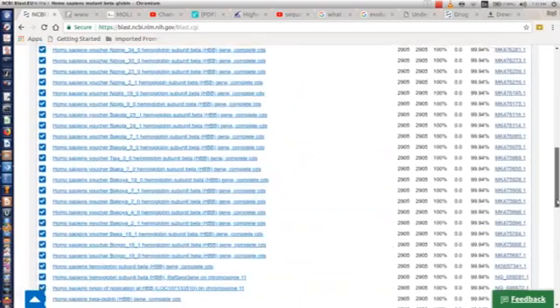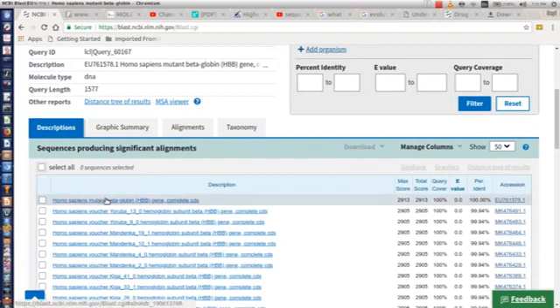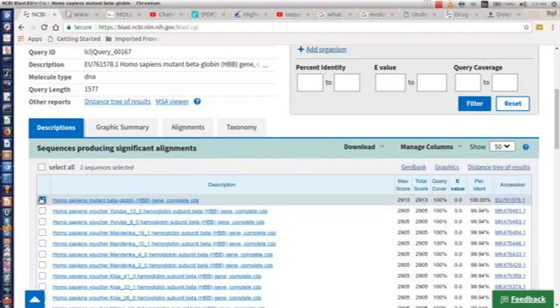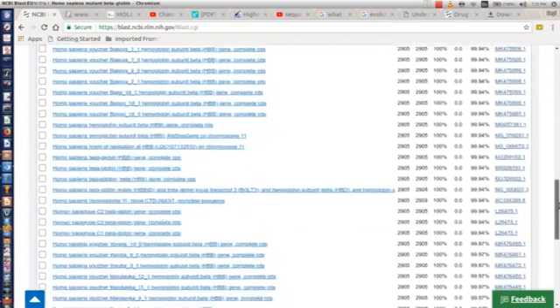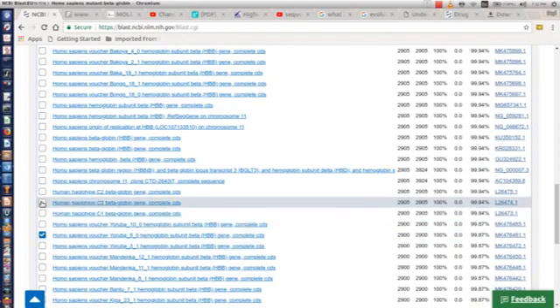So what we need to do is download, because 50 should be too much, so let's work with 15 sequences, including the original one, the actual one, which is the query sequence. Whatever you will be working on when it comes to phylogenetics after the multiple sequence alignment, just make sure you understand that this is your query sequence, this is your original sequence. So you just keep going. Now we have 99.94, a lot of them.